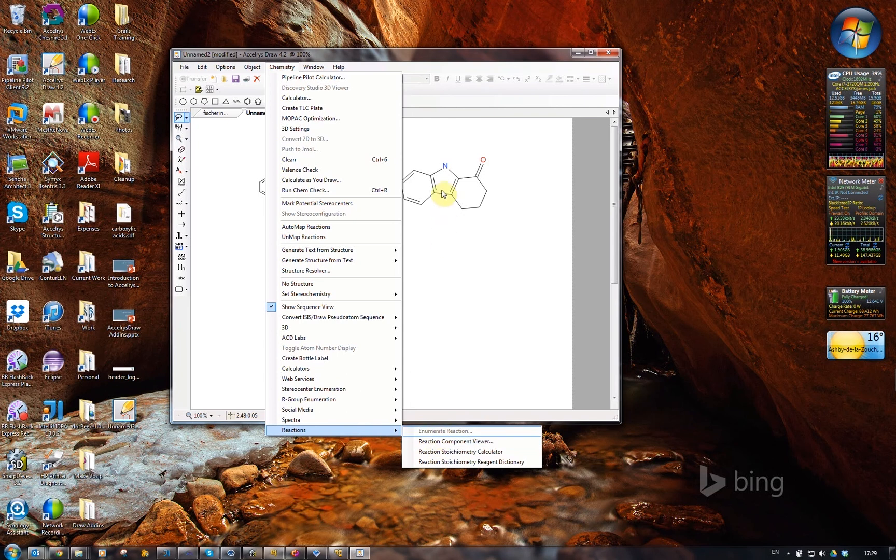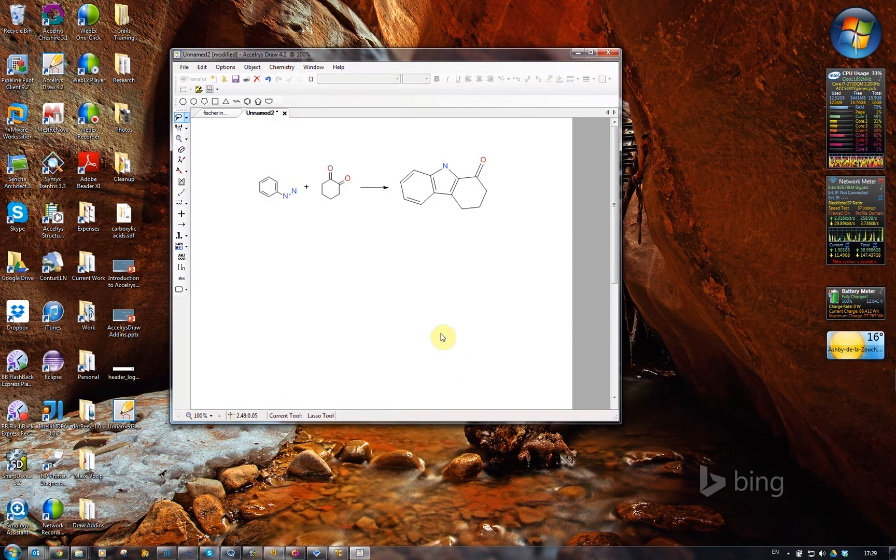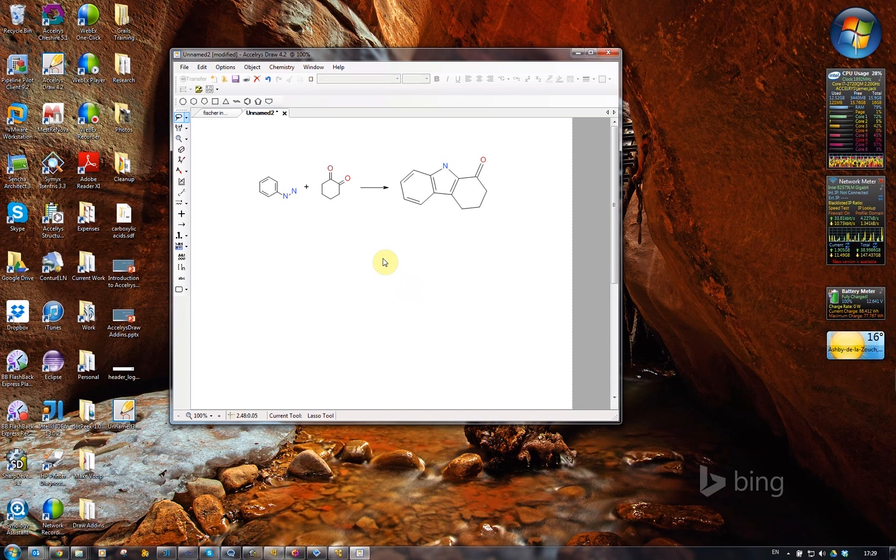You'll notice again, this one has no enumeration centers, so the enumerate reaction menu is grayed out now. But I can use the reaction component viewer. Just hit that click.